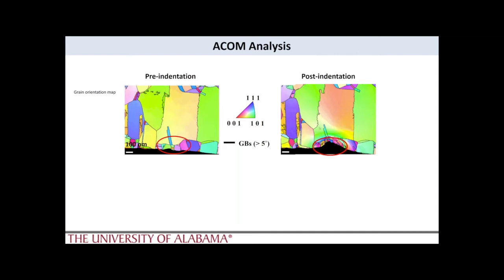And you say, well, maybe the foil itself bent, and that is what is creating this texture change. But again, having PD, I'm able to look on either side of this grain and notice that, yes, the extent of the color changes is somewhat varied, but it's still green, indicating these grains haven't really bent as much as this one. And so this gives us a lot of ability to have confidence, and that'll come out in some of the work on some amorphous crystalline multilayers I'll show later, of being able to determine if grains are rotating or what's occurring at an individual grain basis.